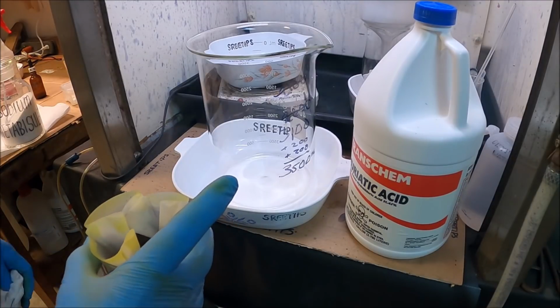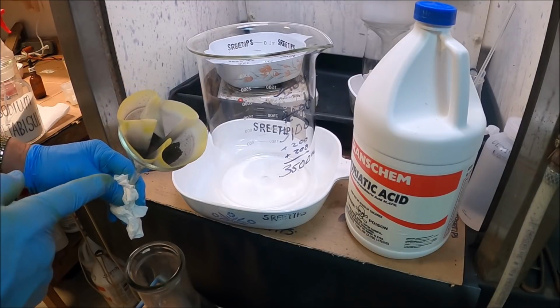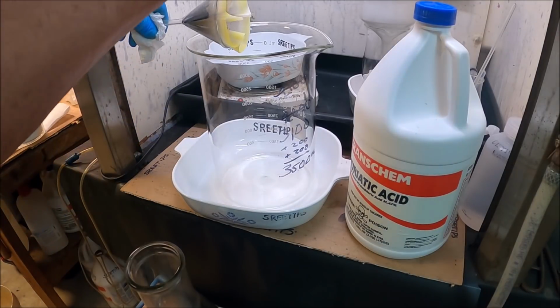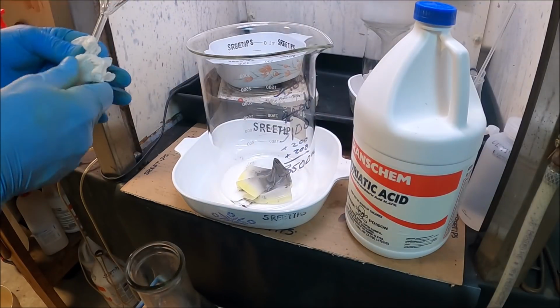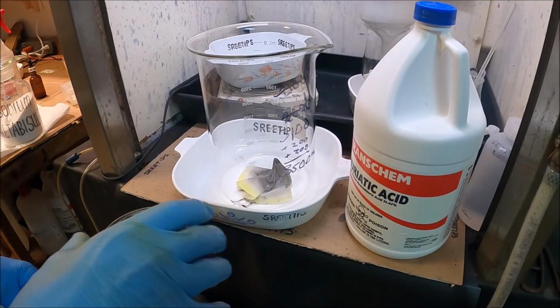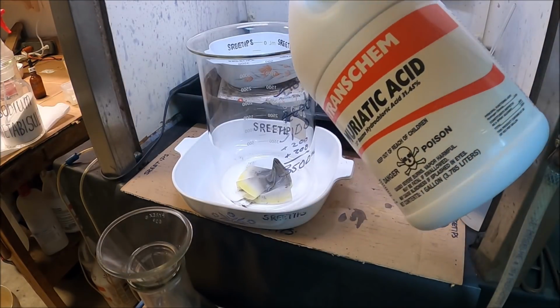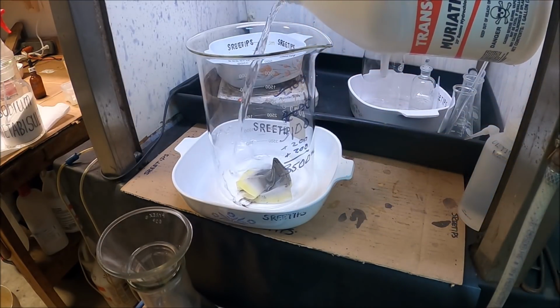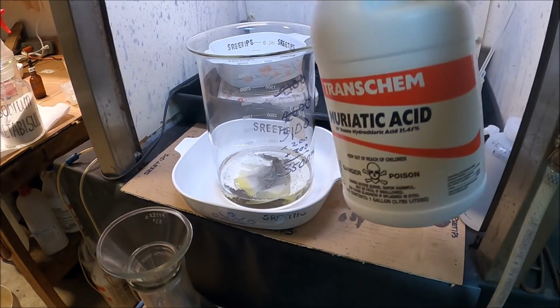I've got it rinsed off now. I'm going to transfer our gold in the filter paper back into the beaker that I rinsed out real good and it came from. Now what we'll do is add some hydrochloric acid, about 250 milliliters or thereabouts.